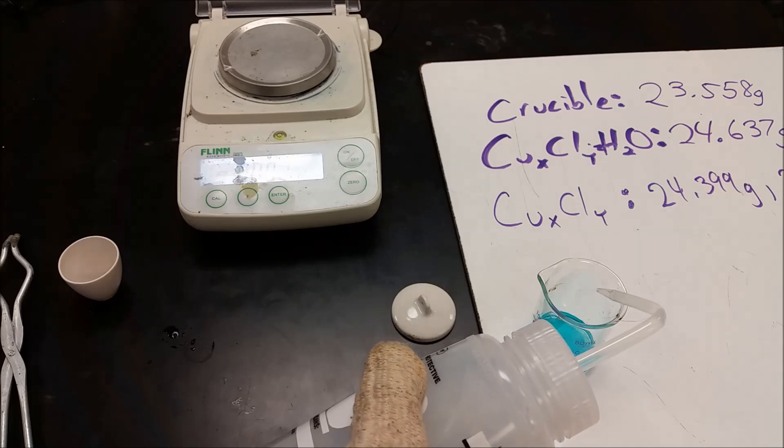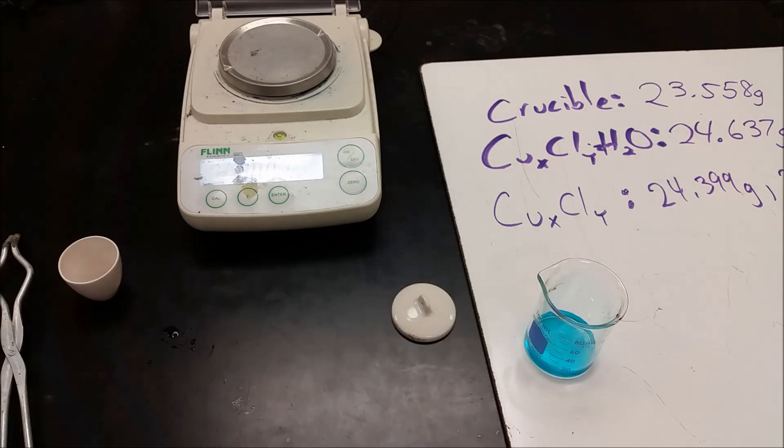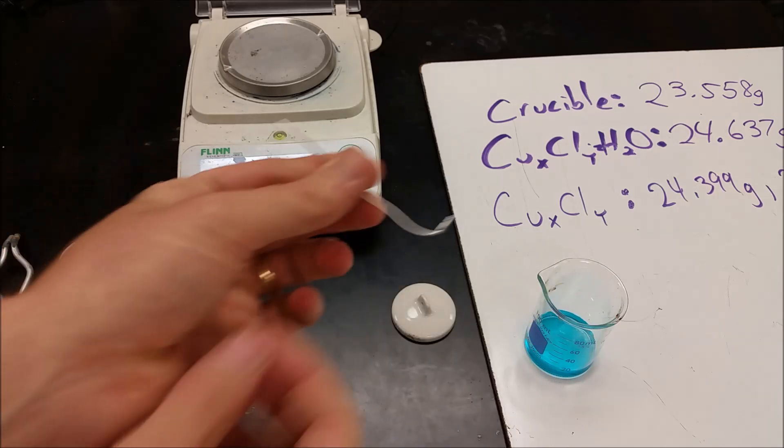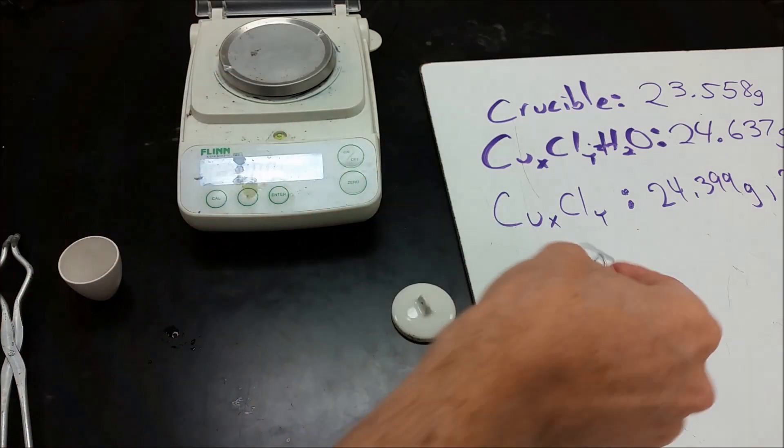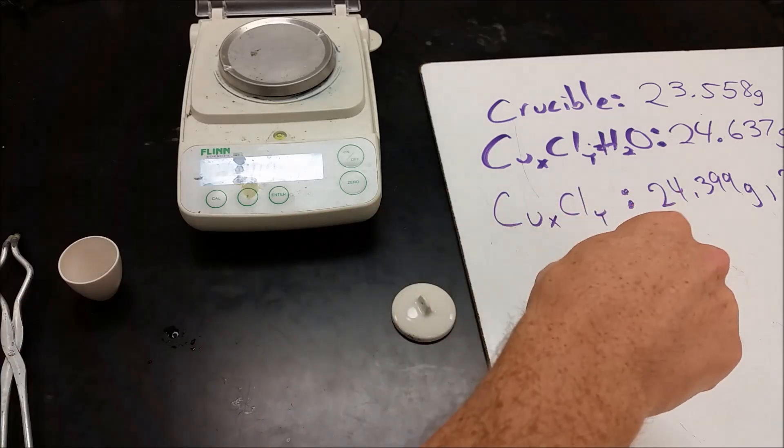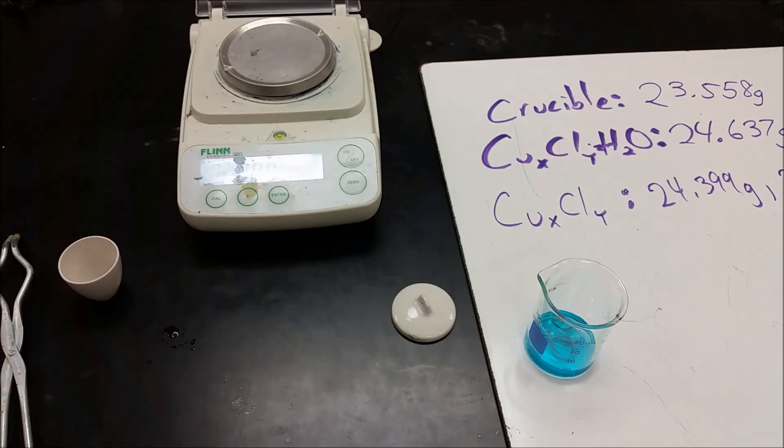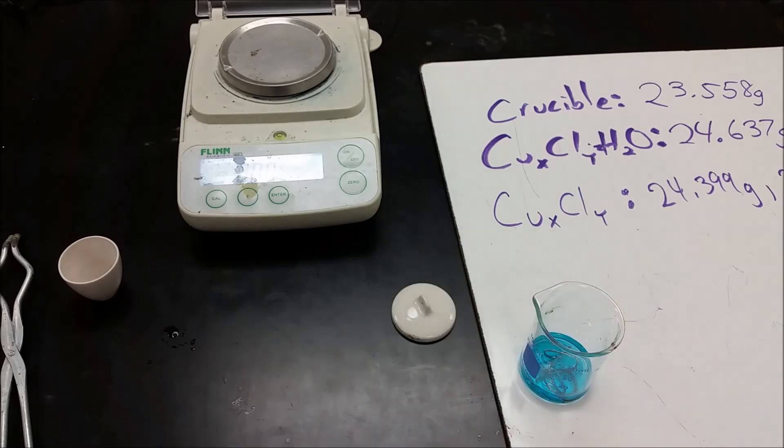So now what we want to do is we want to isolate either the copper or the chlorine. So to do that, what we're going to do is we're now going to add some aluminum wire that's going to displace the copper. And then we're going to end up filtering that. So you want to be careful with the ends here. We're going to bend it away from the ends because they're sharp. We're going to stick those pieces in there. And we're going to leave them in there until the solution goes from blue to colorless. I'll go ahead and zoom in here so we can see this.